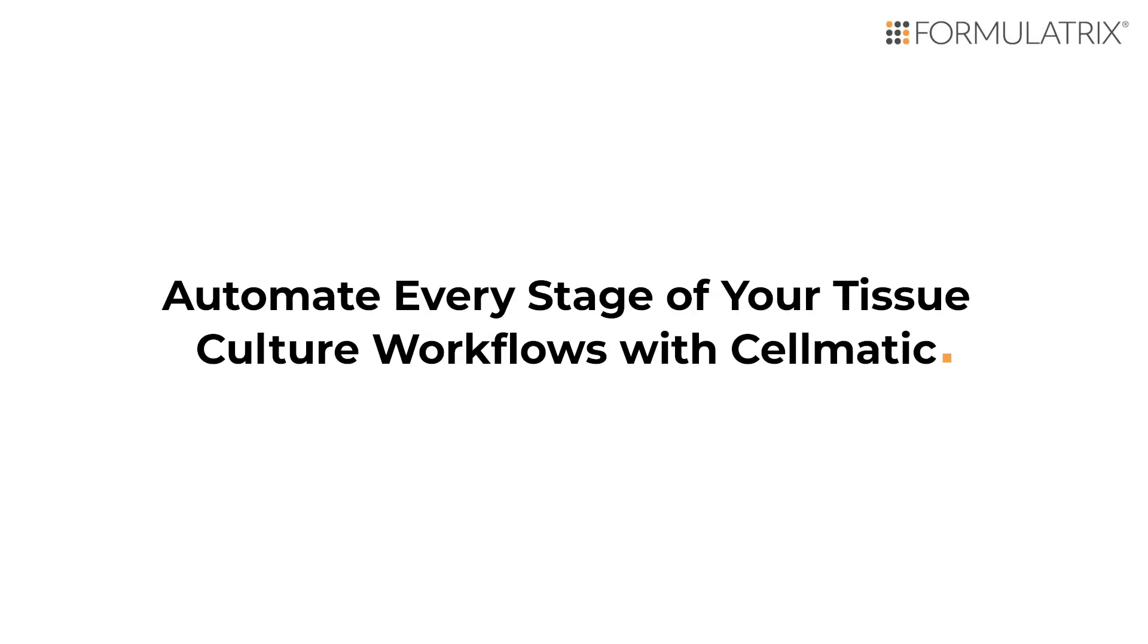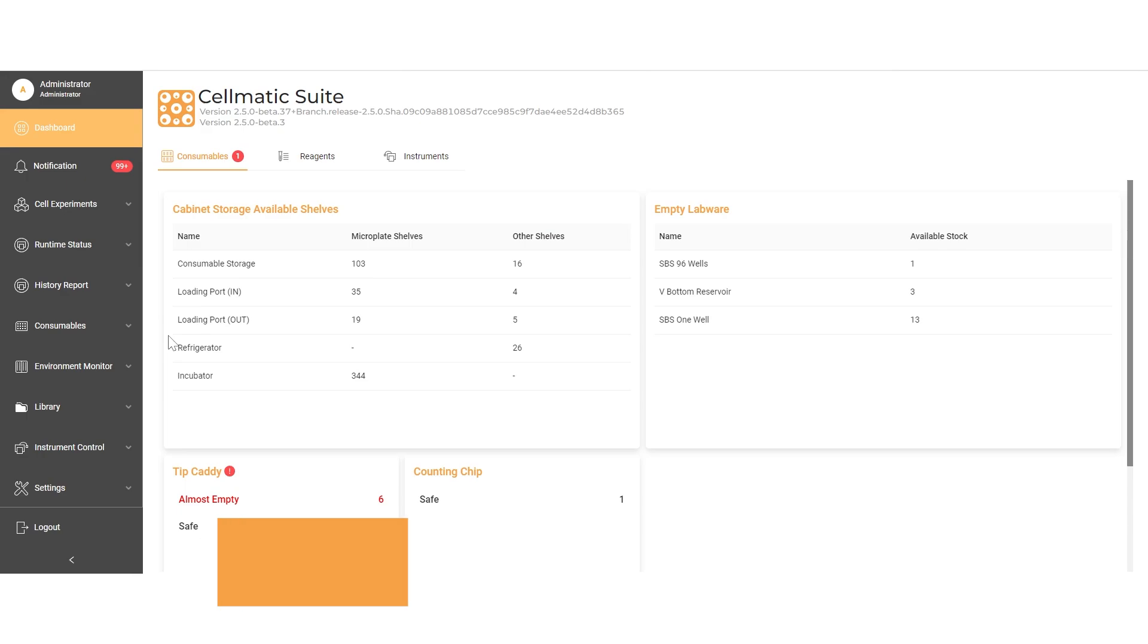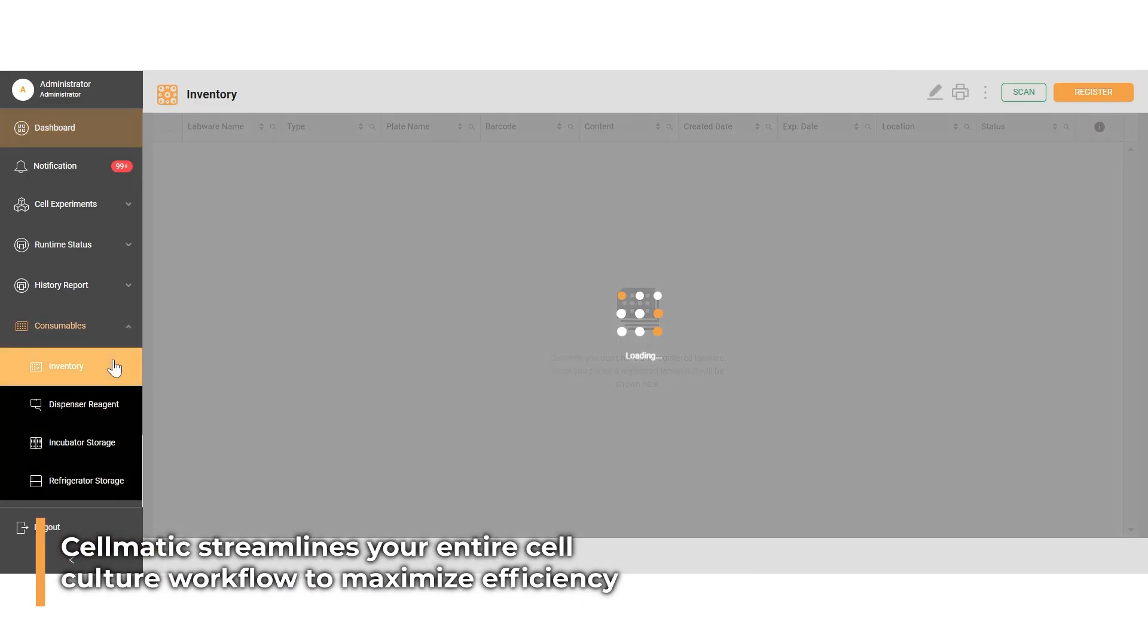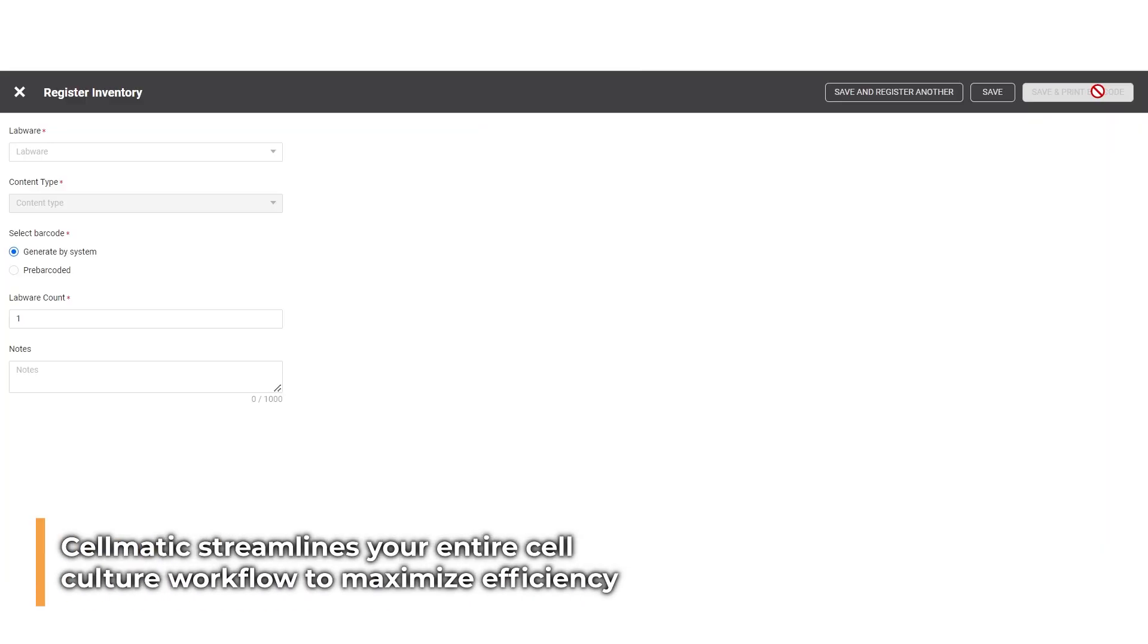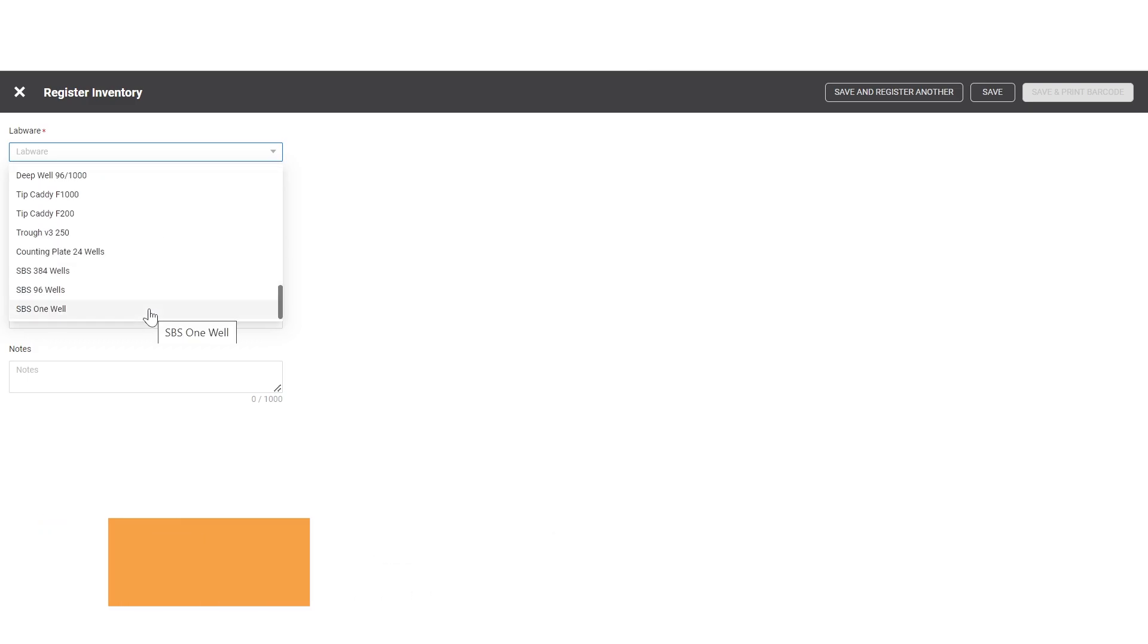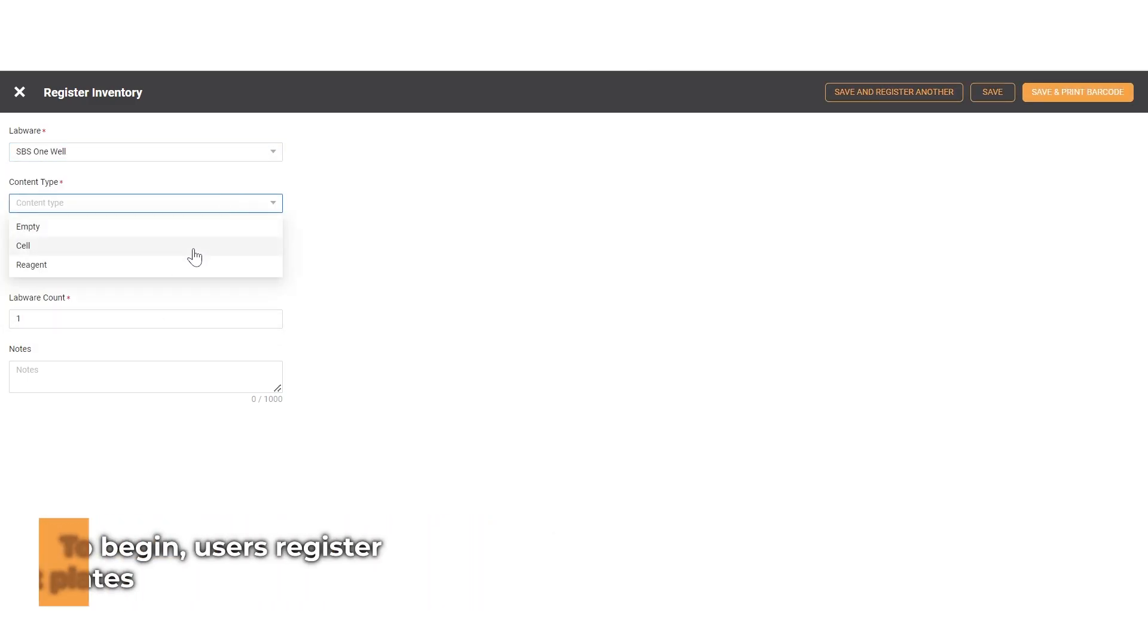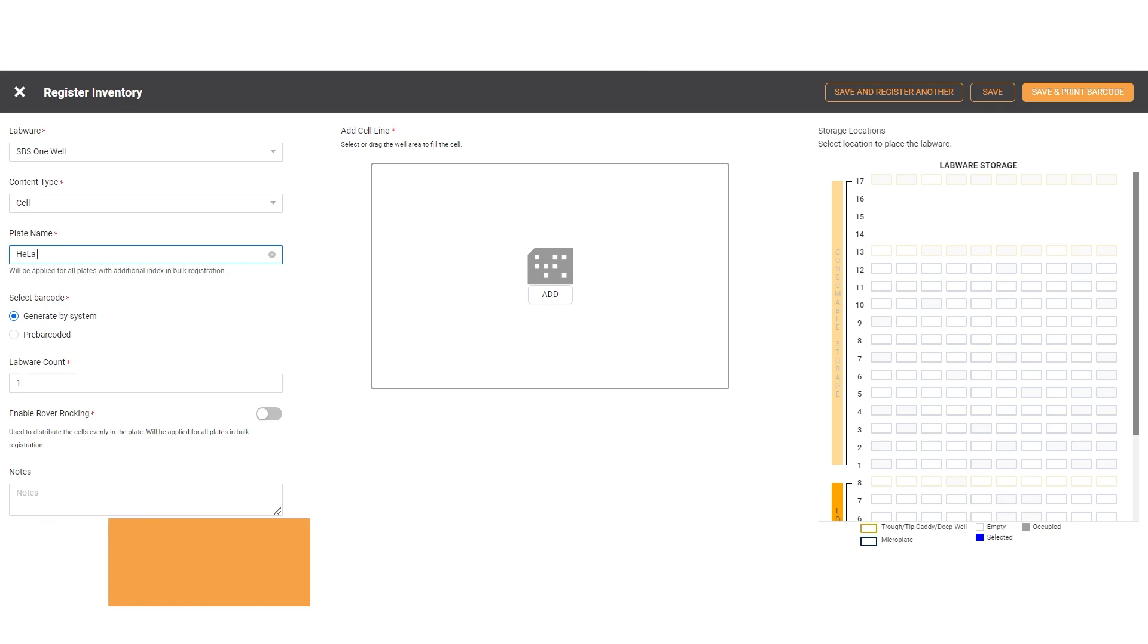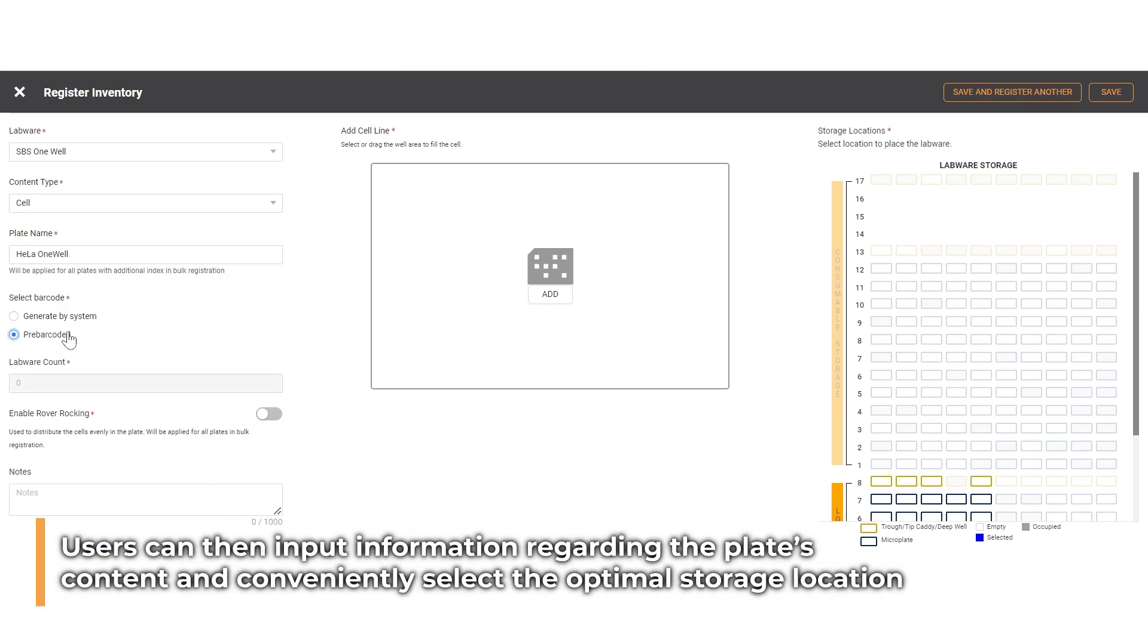Cellmatic is the ultimate tool to streamline your workflow and maximize efficiency in cell culture experiments. First, users need to register the experiment plates.